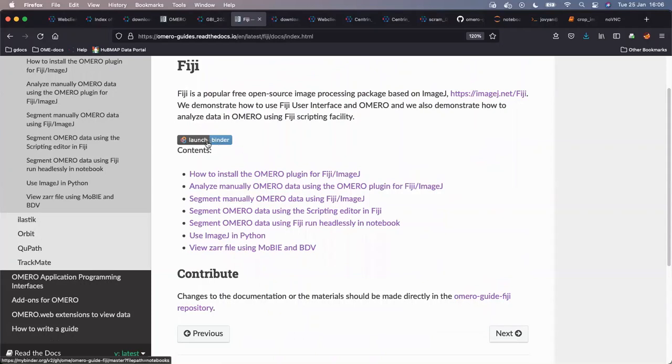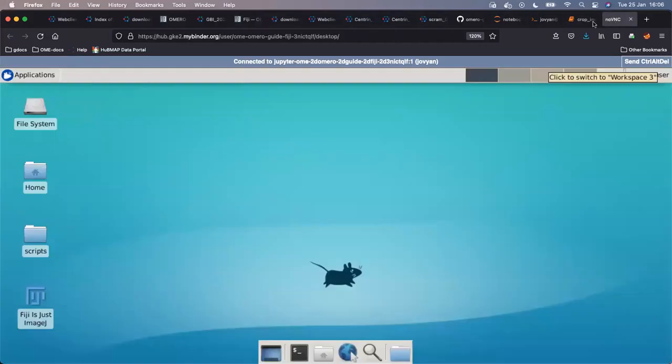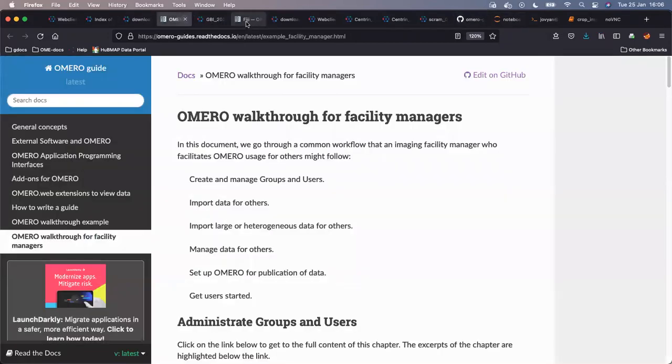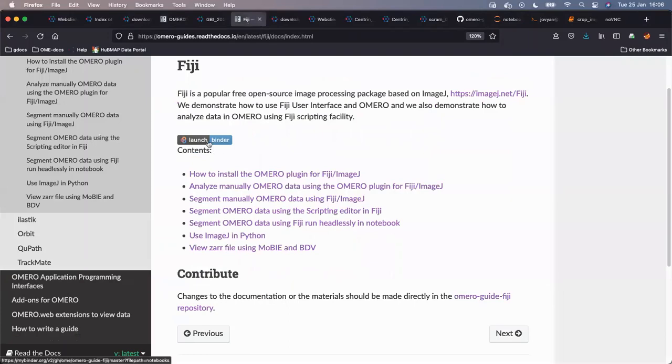Okay, so that's how we would get, obviously, very quickly to this environment, just as easily as I did. You saw I didn't do anything particularly horrific. I just clicked on a couple of buttons and it built up the whole environment for me.